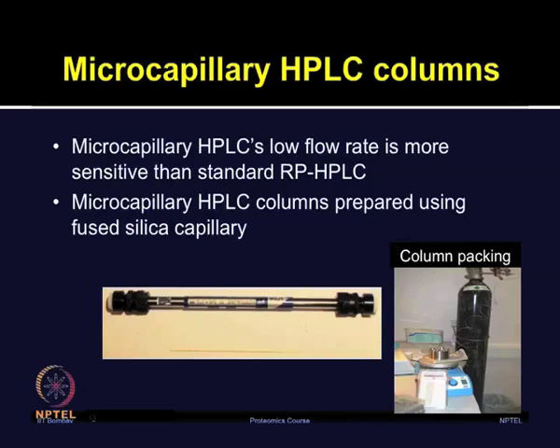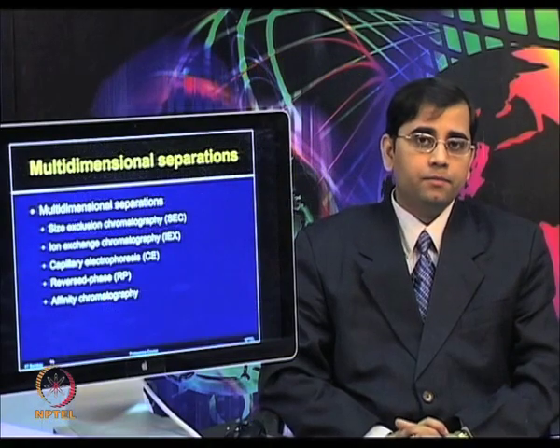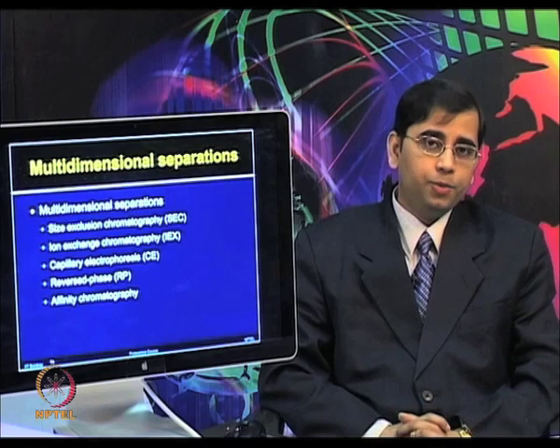The microcapillary HPLC is required for the analysis of low femtomole amounts of peptides. One can prepare microcapillary HPLCs by using fused silica capillaries and then packing them with the reverse phase packing material. For pre-fractionation, multidimensional separations are used.